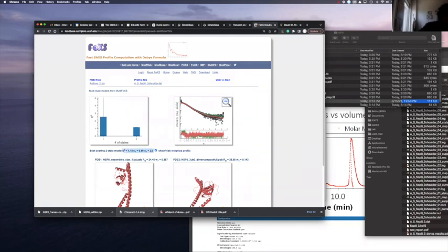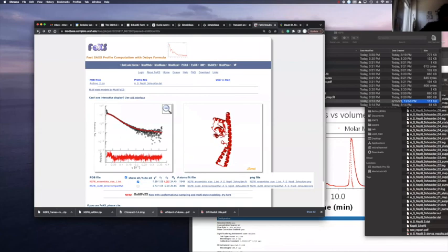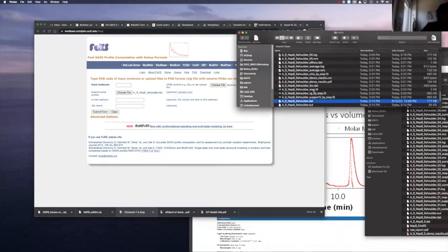We have all the residuals improved, the fit is better, but mostly you can also see the weights: even at the shoulder, you still have a few percent of this dimeric state. It will be interesting to compare that monomer-dimer ratio for the peak data.